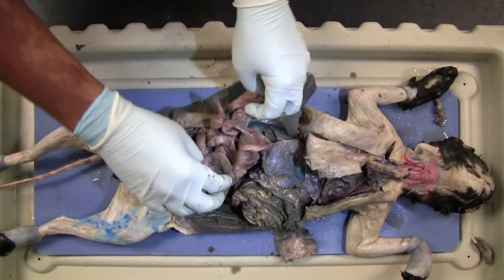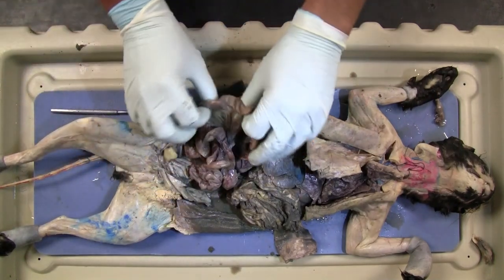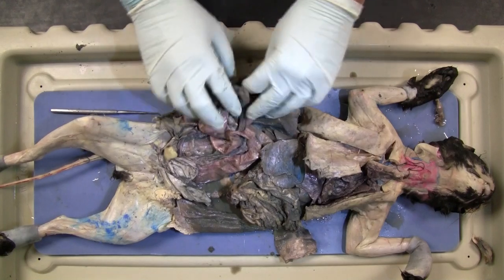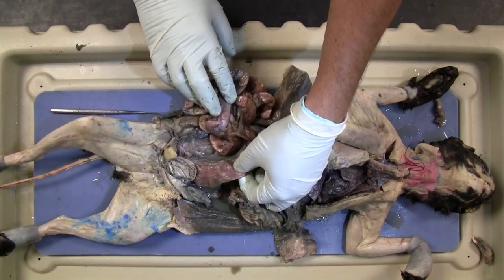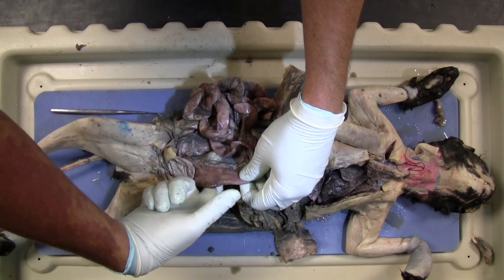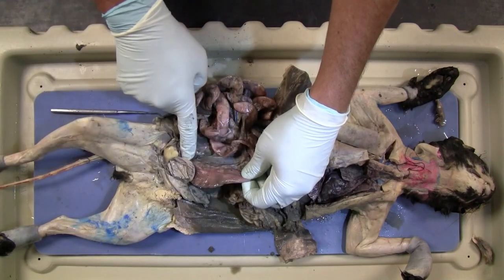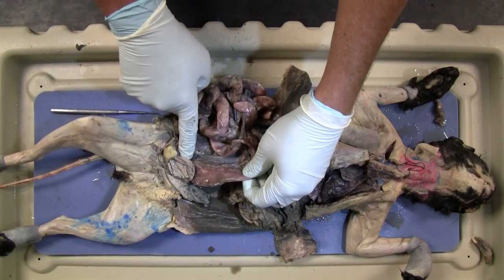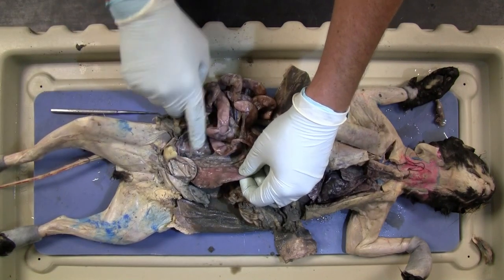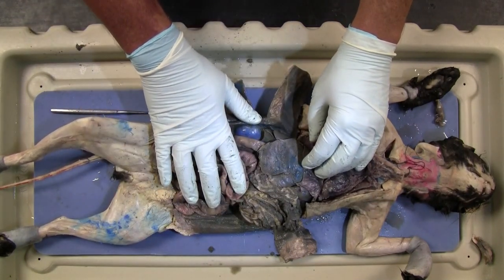Mesentery proper. To find the mesocolon, you first find the colon, and then that membrane that attaches it to the dorsal body wall is your mesocolon, and mesorectum would just be the rectum attached to the dorsal body wall back there. Now that we have the mesenteries down, we're going to do the ligaments.